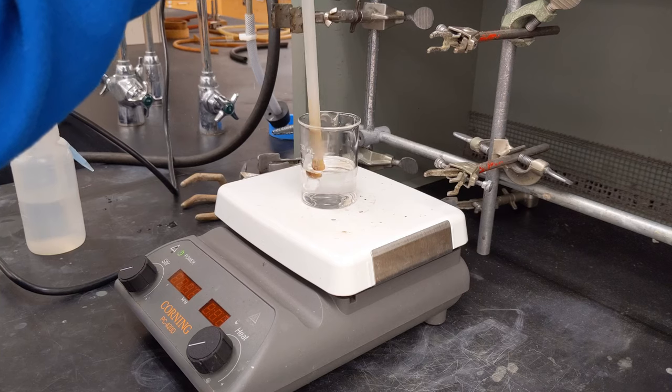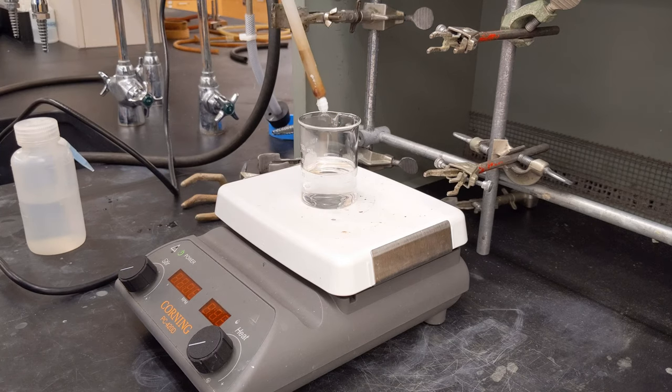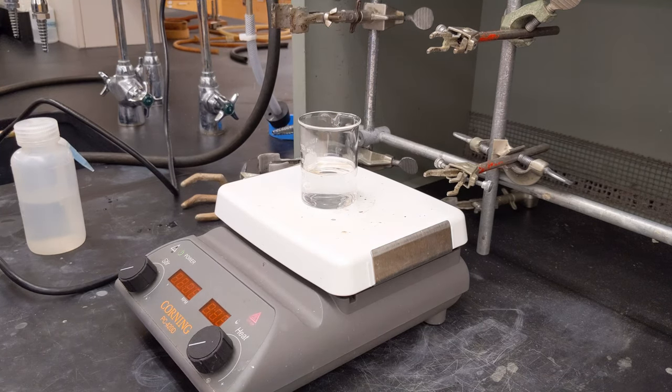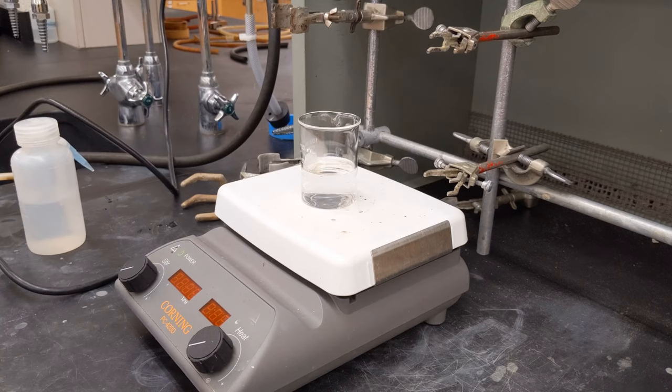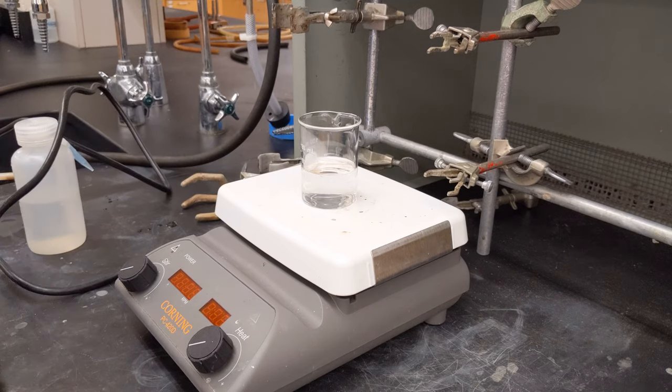So this is a magnetic stir bar retriever. Use the magnetic end to pick up the stir bar and remove it from the container. And unplug it. Remember that this is still hot, so leave it out to cool before tucking it away somewhere.